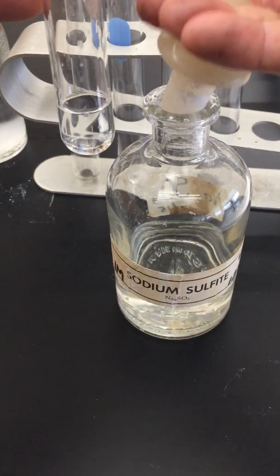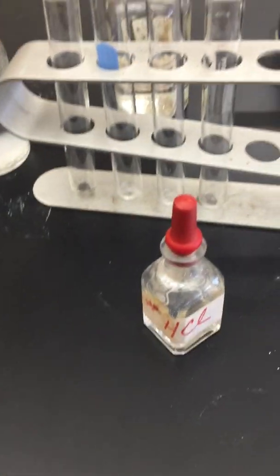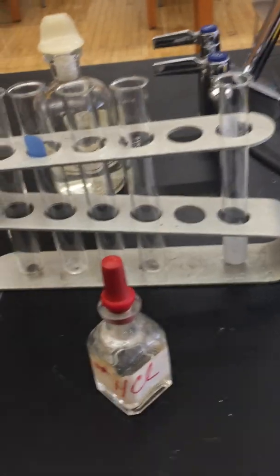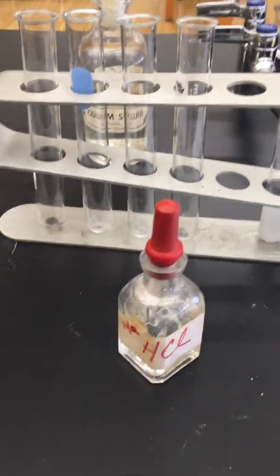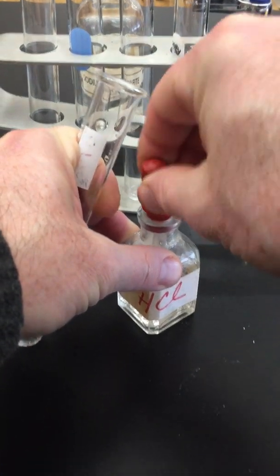That should be plenty. Now I'm going to add about a milliliter of the hydrochloric acid that we used earlier.